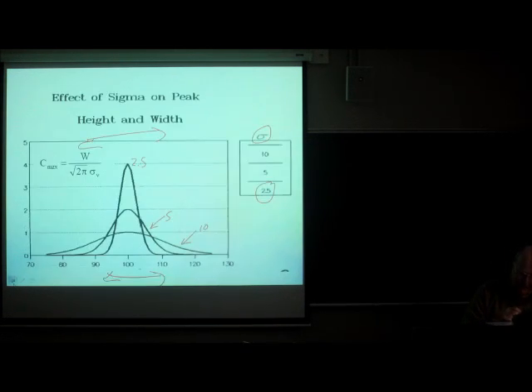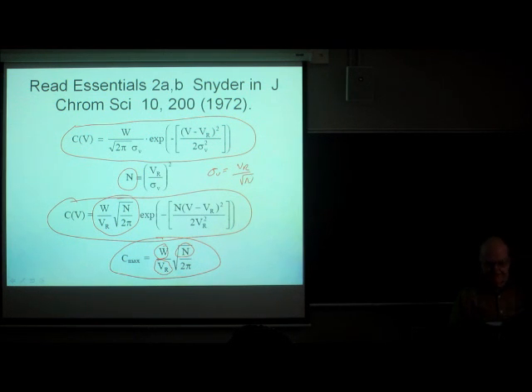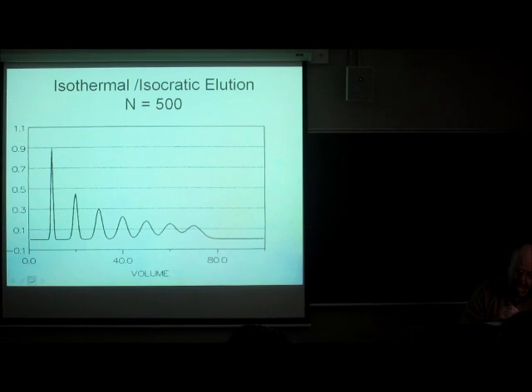And that is an immediate consequence of this Cmax equation. When I manipulate that one algebraically, the N equation, it tells me that the sigma gets bigger and bigger as retention increases and increases. Okay, that's the next slide. I wanted to be here.